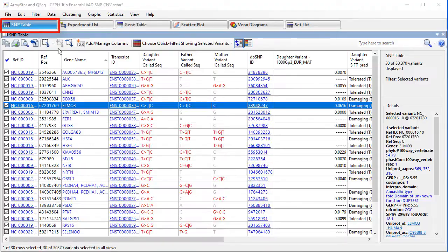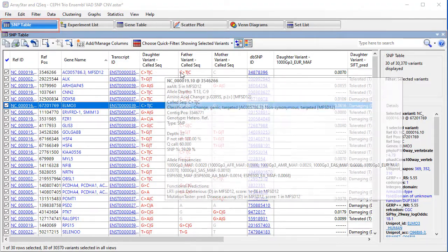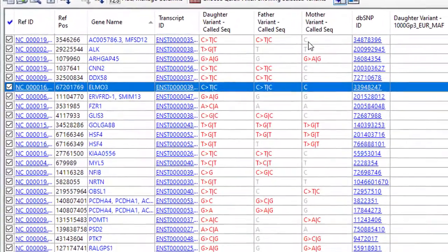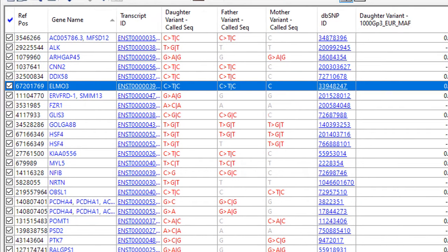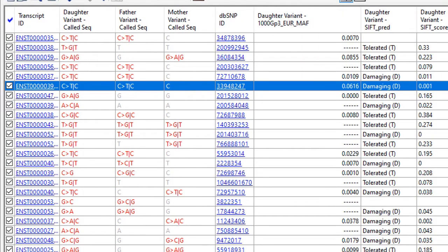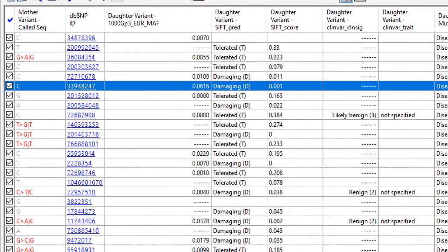Variant data is available in the SNP table, which shows the base call for each variant position in each sample, as well as dbSNP and other annotation information brought in from the variant annotation database.